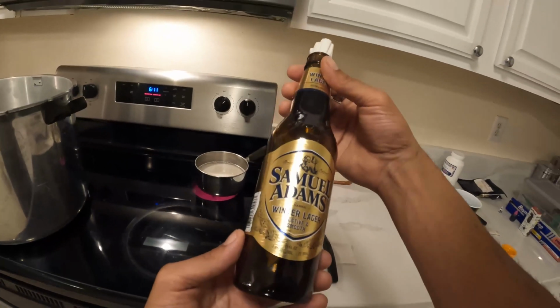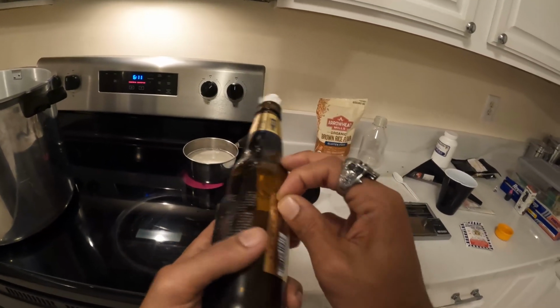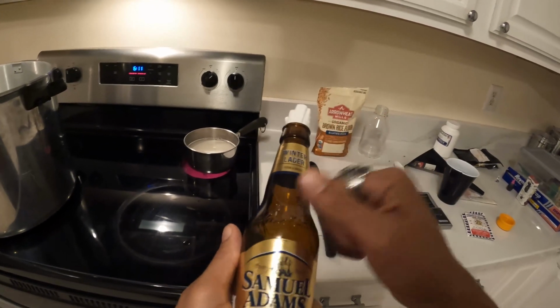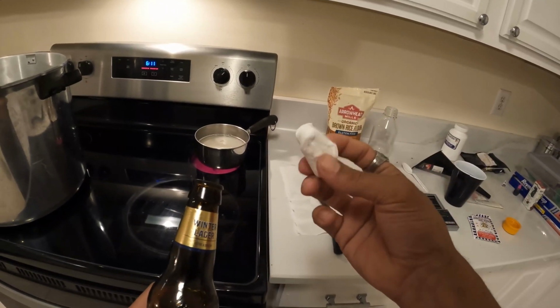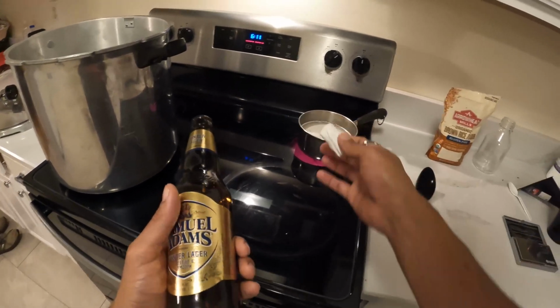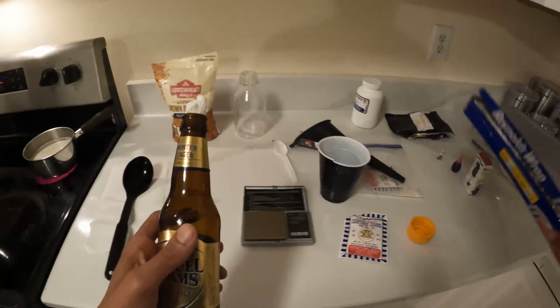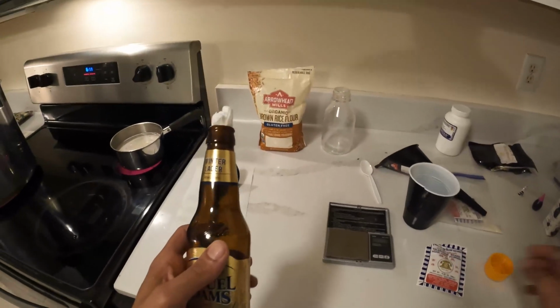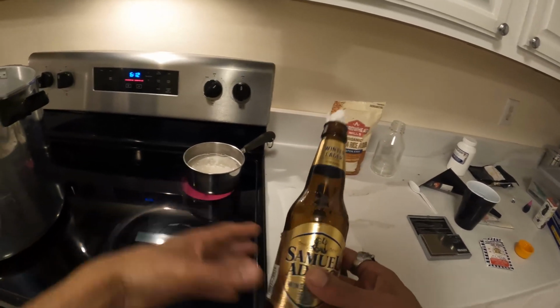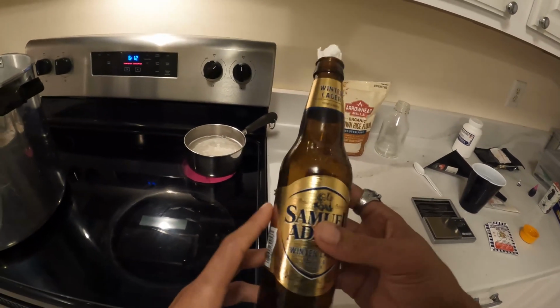But you can absolutely use a beer bottle or any other type of bottle. Just probably want to make sure you pull the labels off before you go ahead and stick it in the pressure cooker. If you're going to have to use a bottle like this, you're going to take a napkin once you have the broth poured into here, and just put that in there, and then you want to go ahead and cover it with foil. So if you're going to be using a bottle like this, you're probably going to have to do the stovetop method. I'm not sure if it's going to fit in your microwave, so just something to be aware of.